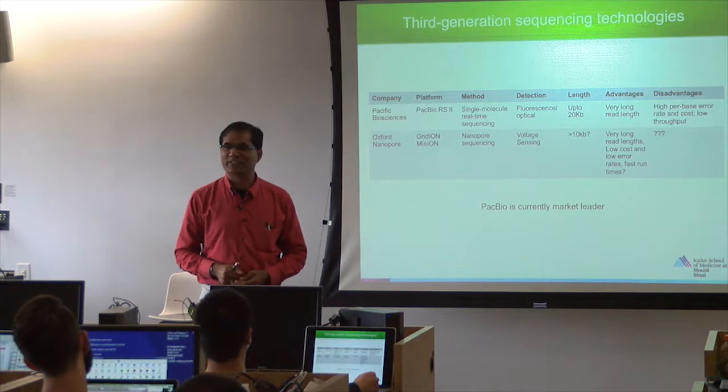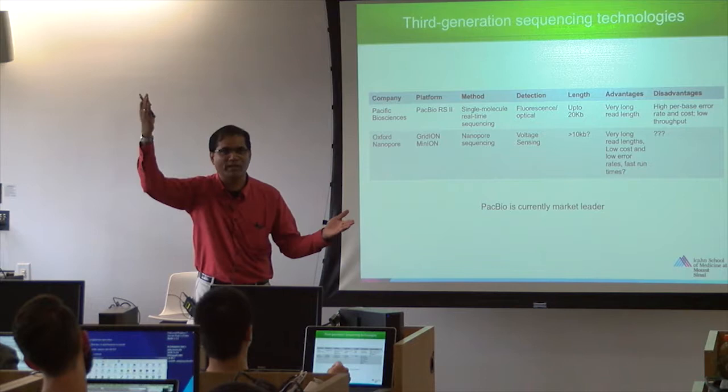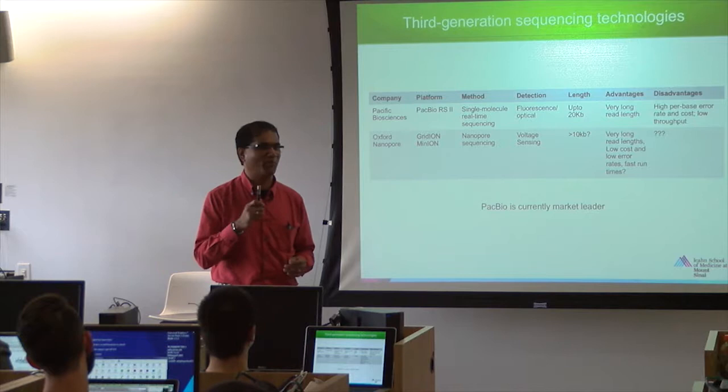What we have to do first to do that is break a leg of the polymerase. Don't run so fast. If I'm running a sprint, by the time I'm looking, you are done, a 100 meter dash within 9 seconds, right? So I want to break one leg. Take your own time to go there. I will allow you to go there, but at my determined time, at a slower pace. Break the polymerase leg. That means what?